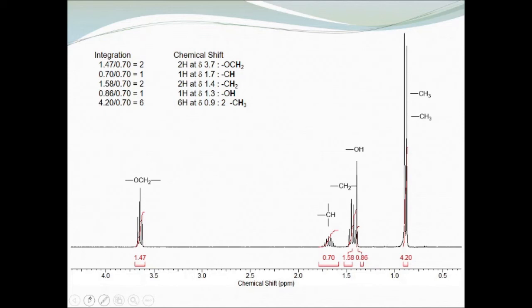And then the next question is, how do we put these together? Of course, we'll start with the obvious one. Since this is the alkoxy, that oxygen will be the alcohol, and so this gets bonded to it, and we get this fragment here. So now we have an OCH2. So what else is this carbon bonded to? Carbon has 4 bonds. We see 3 of them, 2 to hydrogen, 1 to oxygen. If we look at our splitting here, this is a triplet.